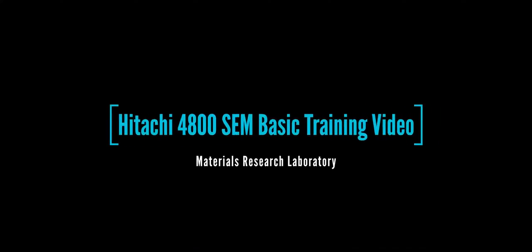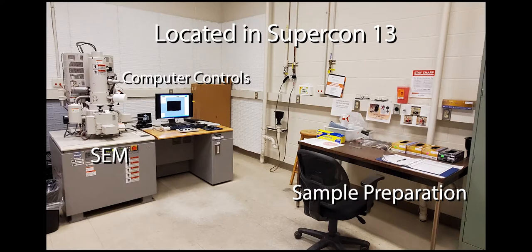Welcome to the training video for the Hitachi 4800. This instrument is located in Supercon 13. To begin, we will first discuss sample preparation.